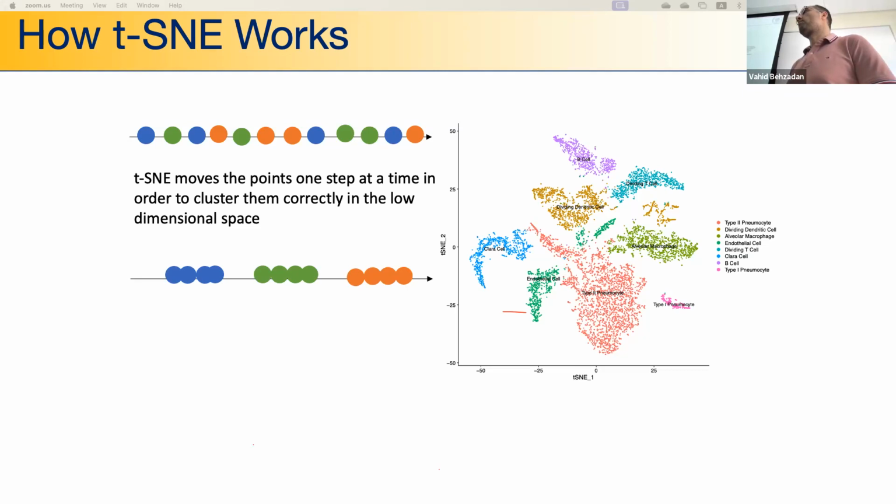You assume that the samples that you take are descriptive of the type of system that you're trying to identify at the time point of the data collection. So it's a snapshot in time. It's not an assumption about steady state or about the transient response. It's just an assumption about the time point that we collected this data.